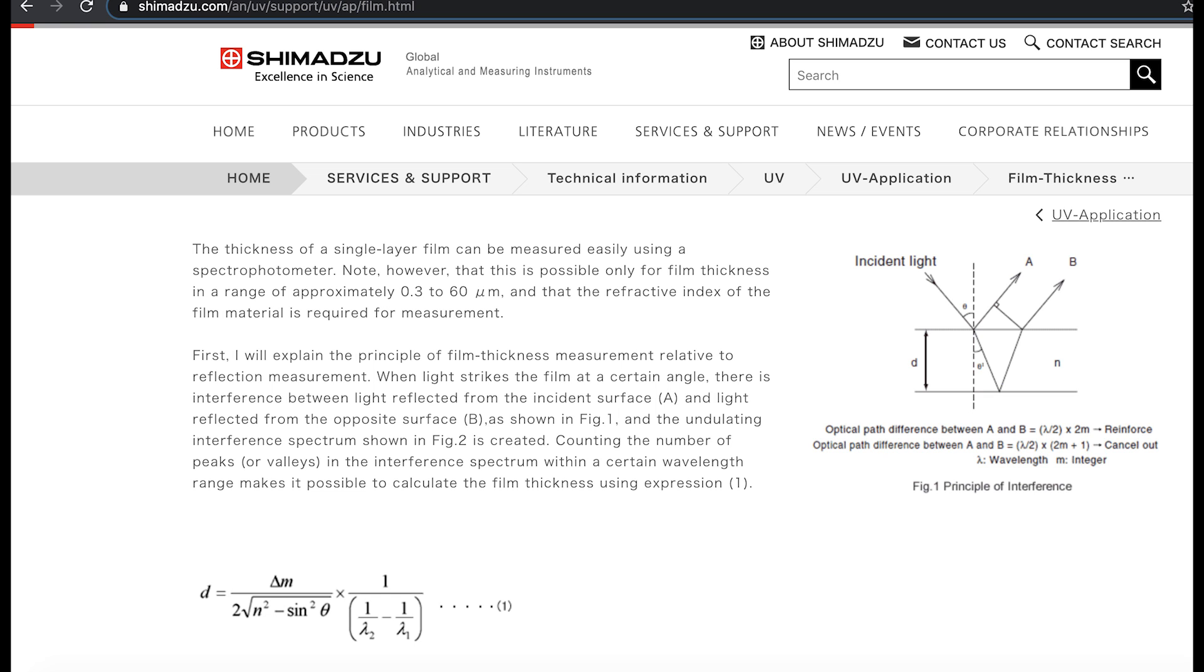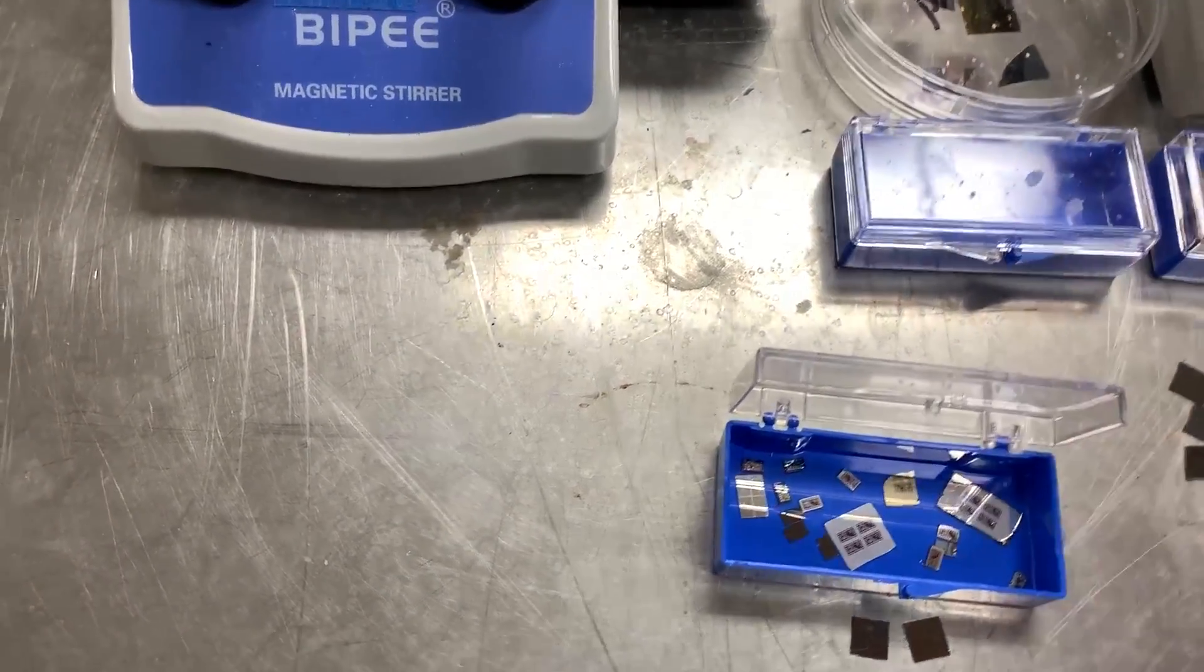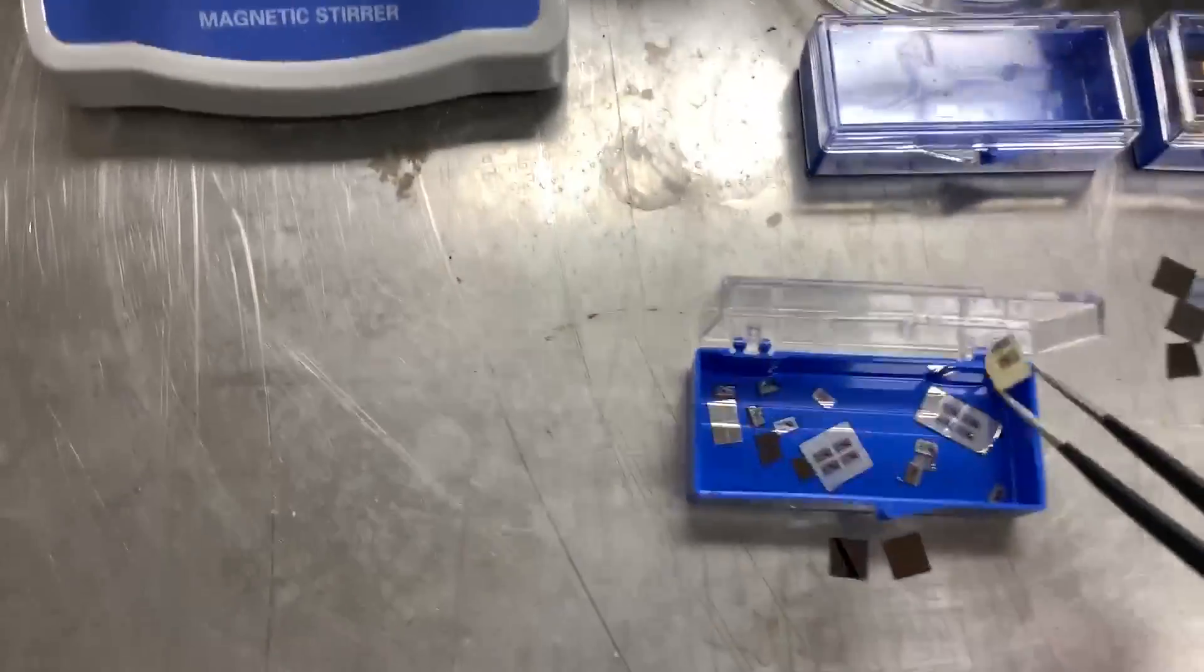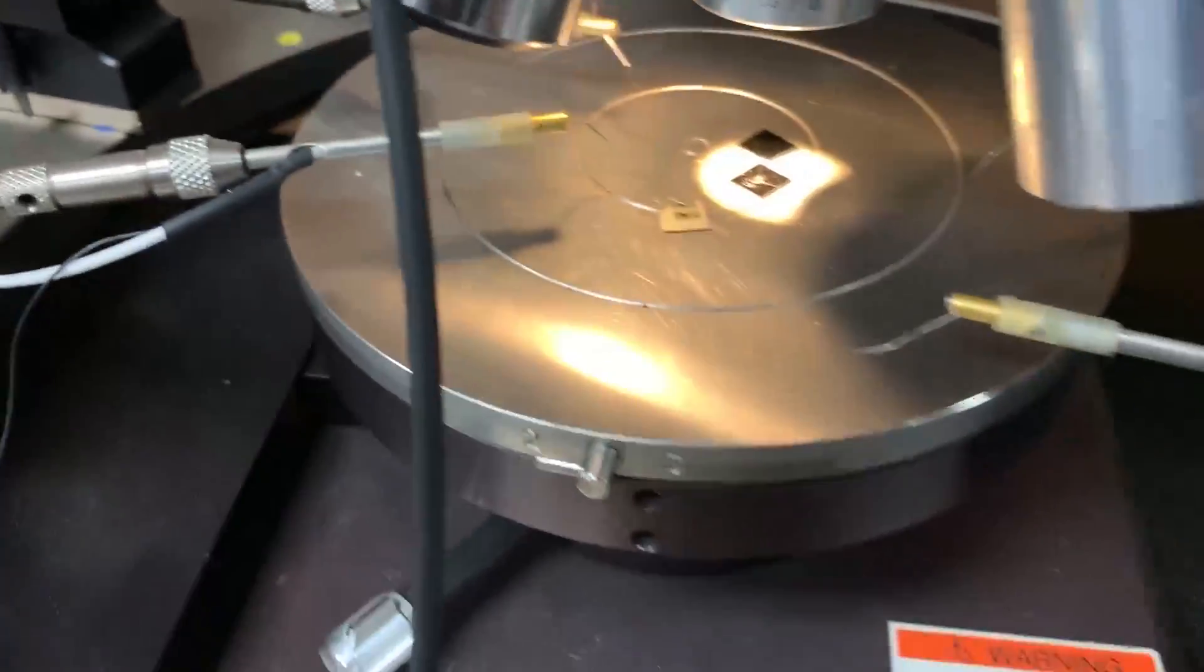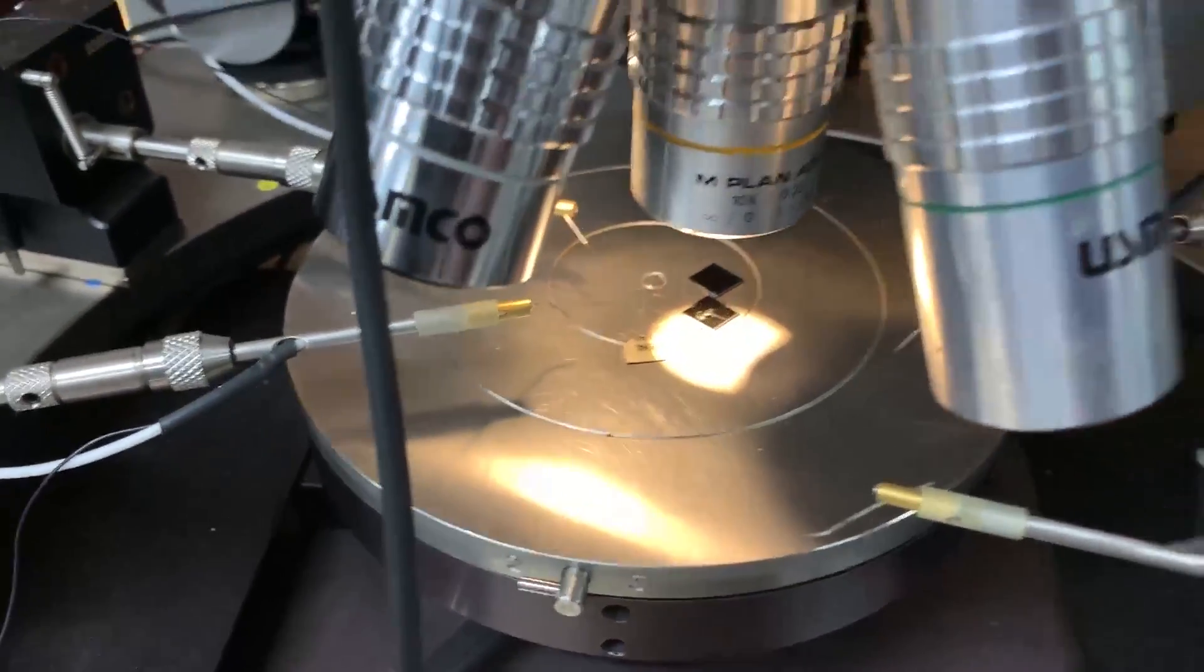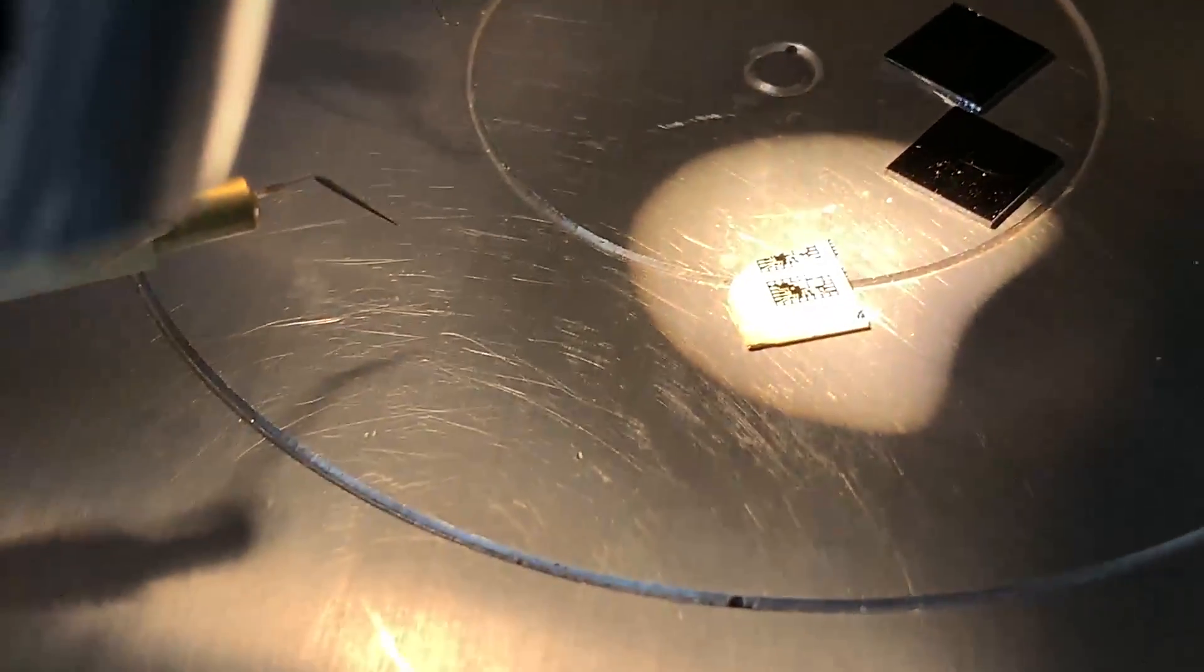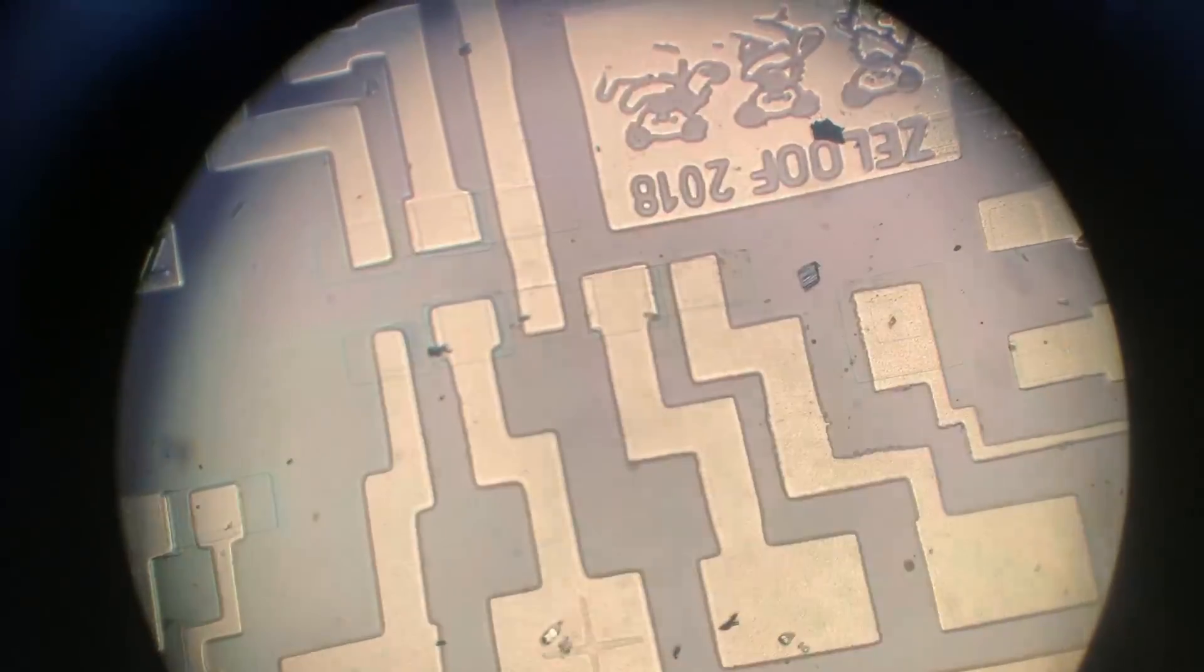I can grab a sample that was coated with some thicker photoresist that was more viscous and this in theory is about a 2 micron film. To measure a new sample I just put it under there and we'll move over the xy stage to kind of focus on the sample we want to look at. This sample is a broken fragment of a chip I made but it's coated in photoresist so it's perfect for this.